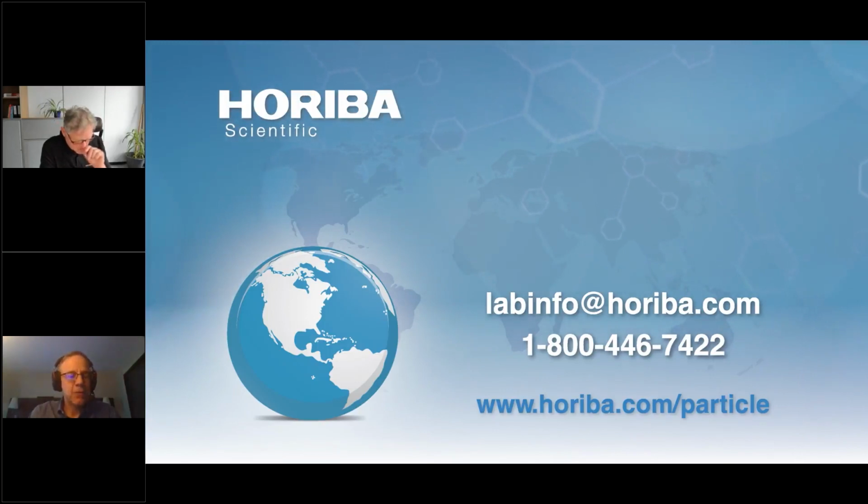But you mentioned inorganics and pharmaceutical, and I'm going to point out that there are a fair number of excipients with fairly large particle sizes, and those are amenable to analysis by dynamic image analysis. In solid dosages you have a lot of particle handling processes, in tablet manufacture or in the larger particulate formulations, and all of that is very amenable to analysis by dynamic image analysis.